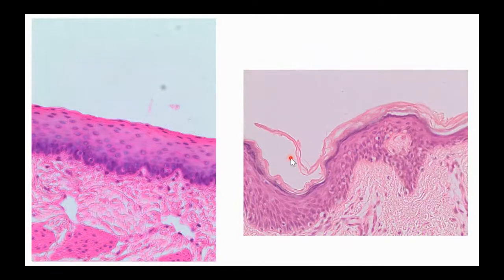All right, let's switch gears out of our simple epitheliums to start talking about our ones that have more than one layer. Remind me in the chat, if you are an epithelial tissue that has more than one layer, what's the first word in your name? More than one layer. Absolutely right. We're starting to talk about stratified tissues.